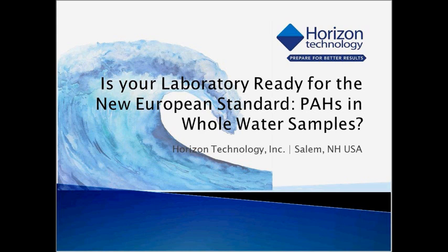This webinar will be about 30 minutes, and then we'll go to the questions. The webinar is about one of the three new European standards that were adopted by the Water Framework Directive. The first one we're talking about in this webinar is about PAH, Polycyclic Aromatic Hydrocarbon, PAH.